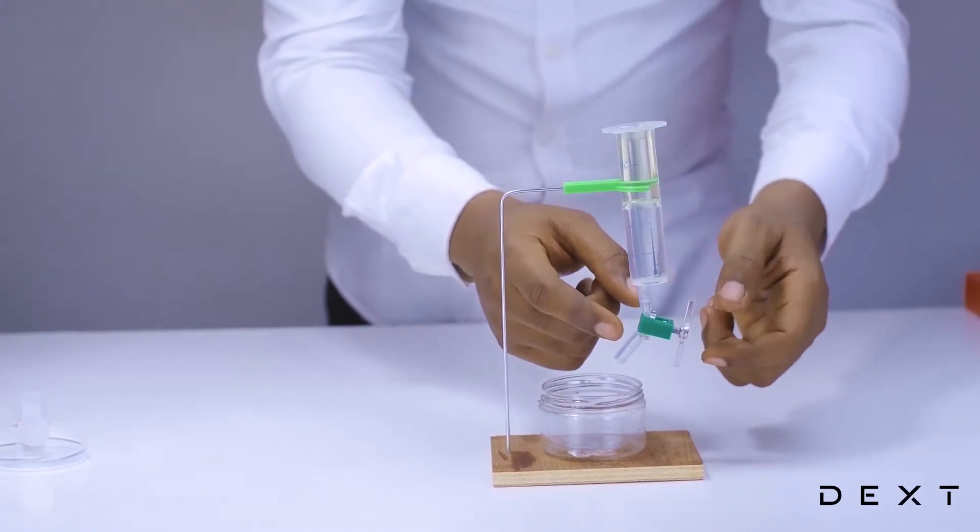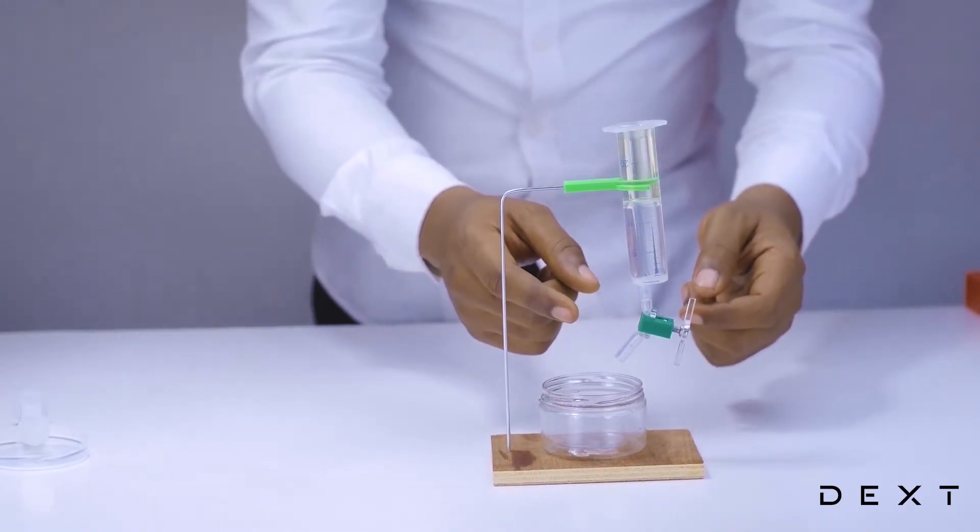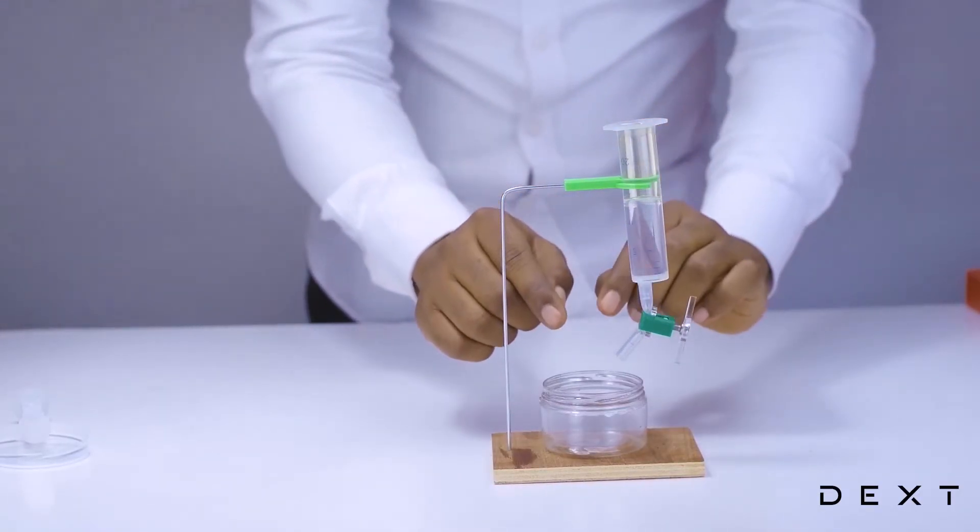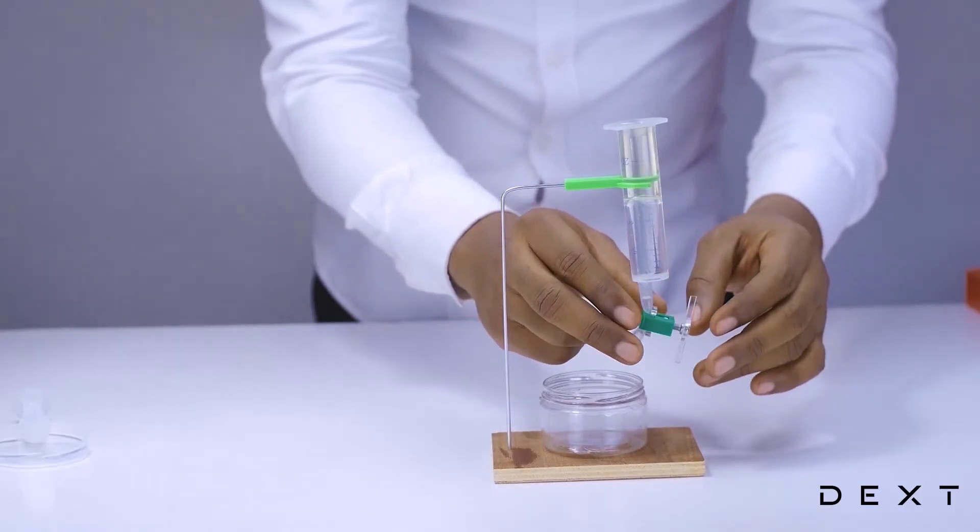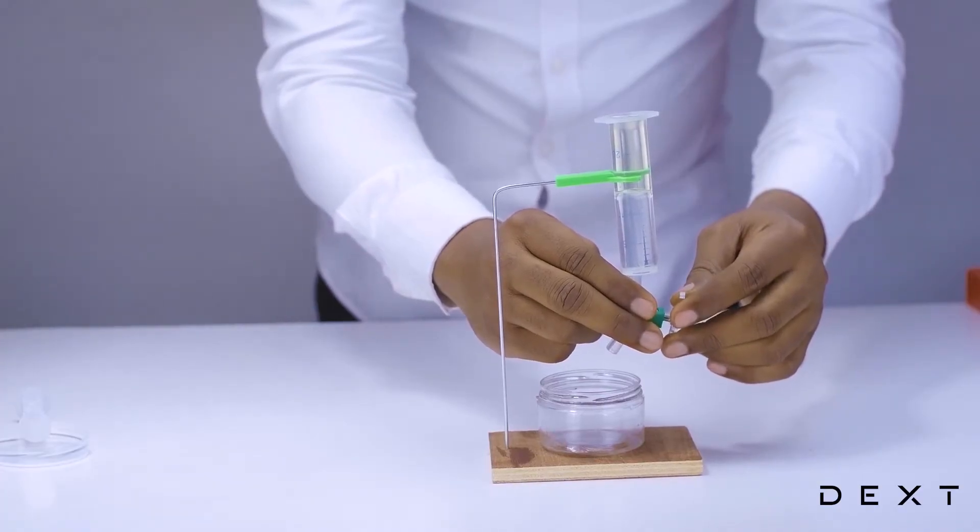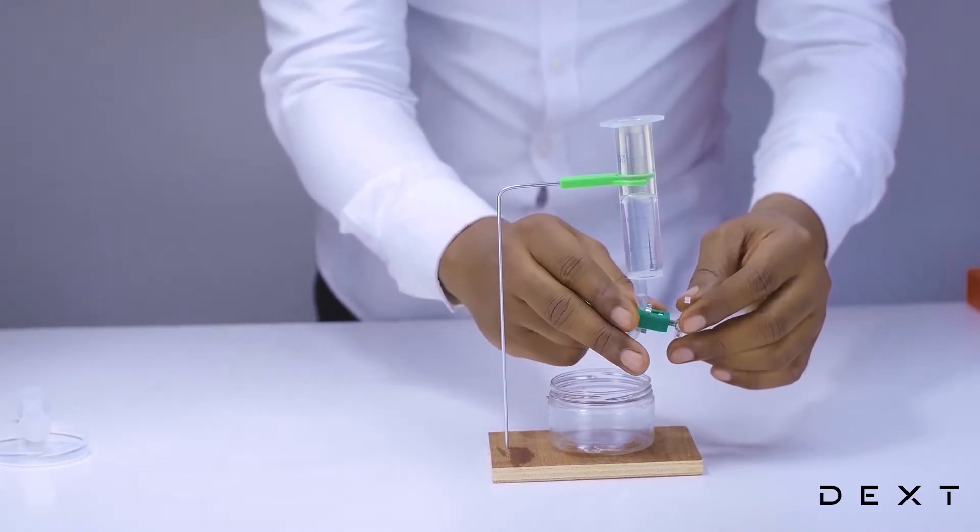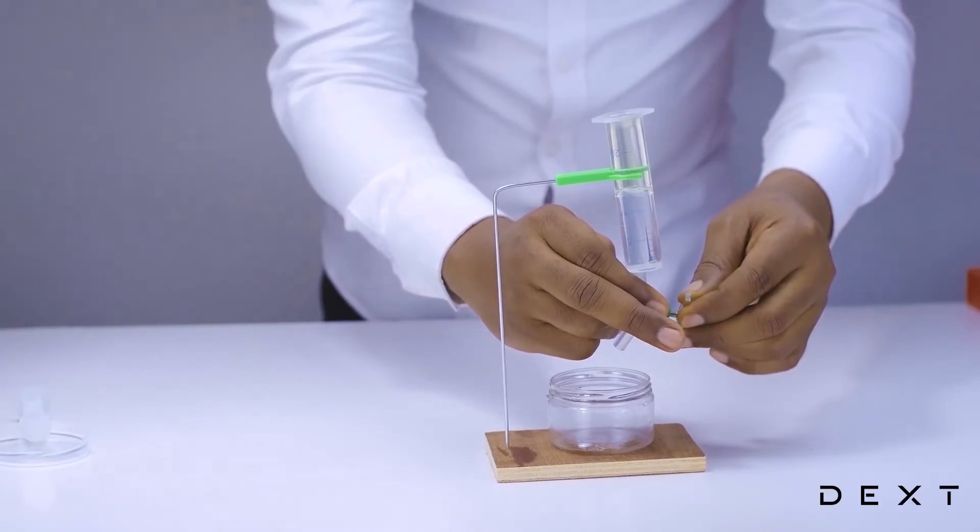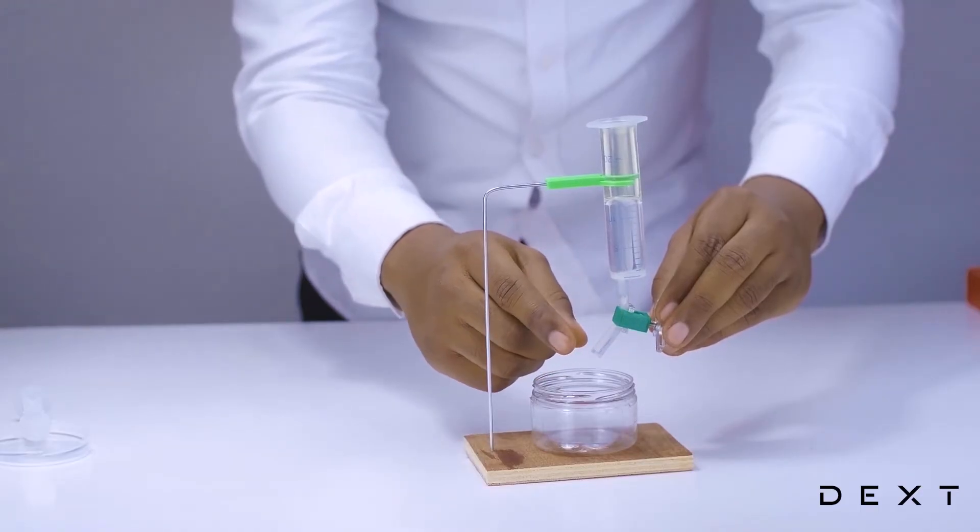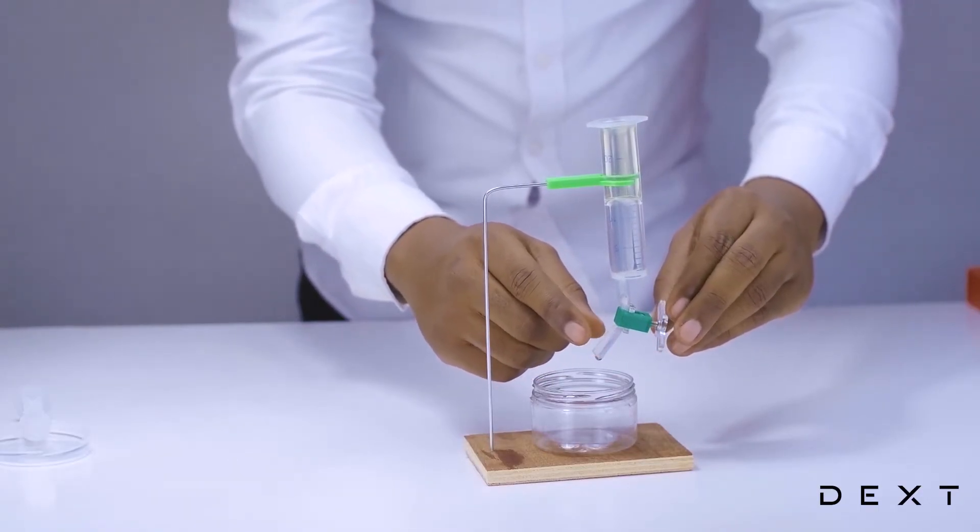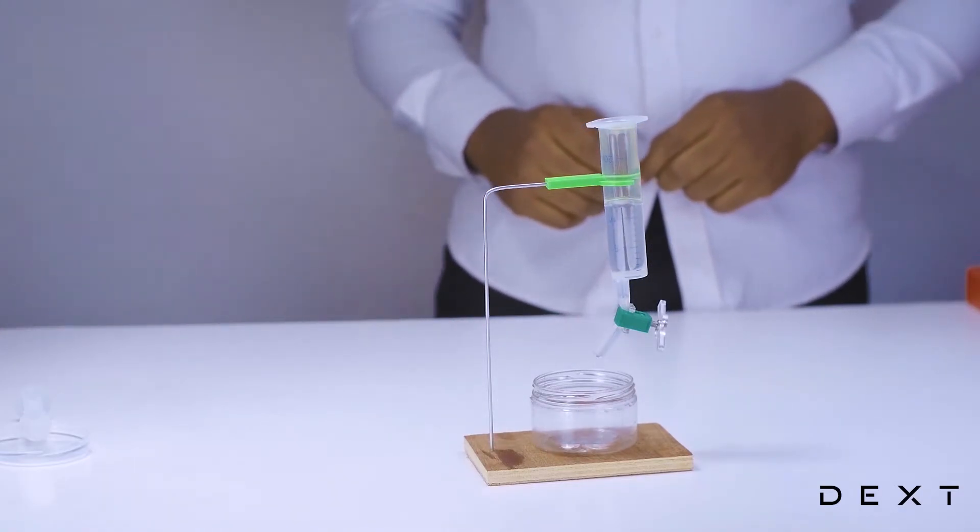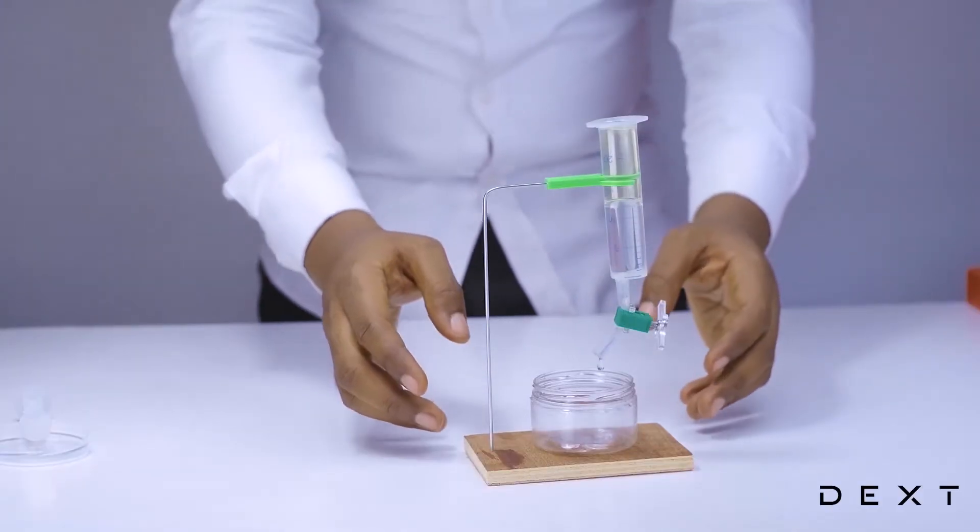Okay. So after you've left your setup for about 15 minutes, you are going to gently open your tap until you see the liquid at the base, in this case the water, starts to drip. There we have it. Our water has started dripping. We are going to leave it this way for some time until all of the liquid at the base, in this case the water, is completely drained.